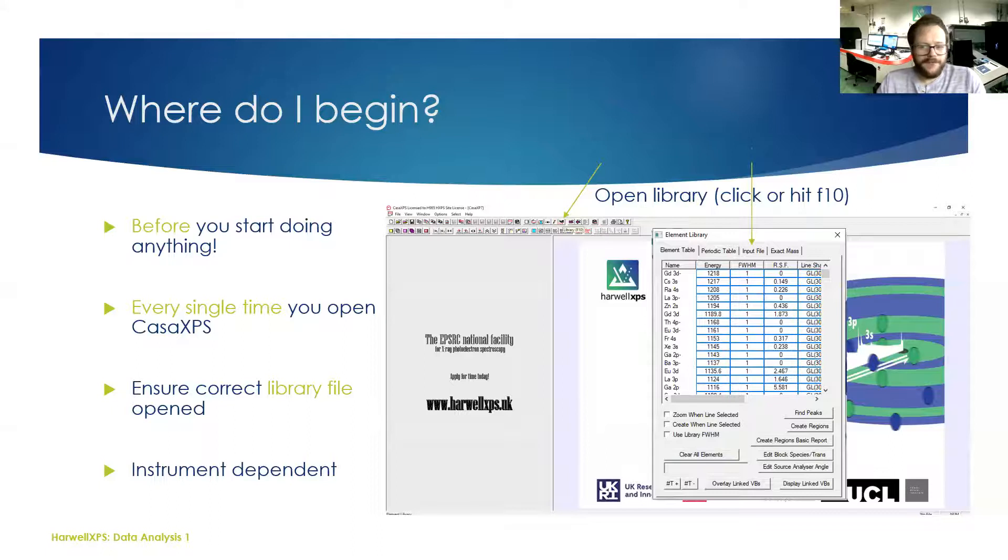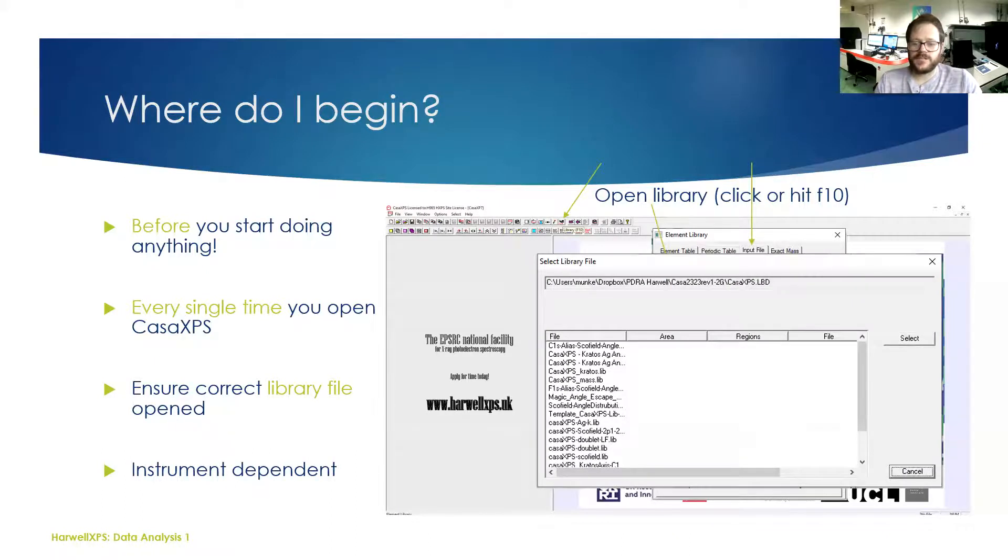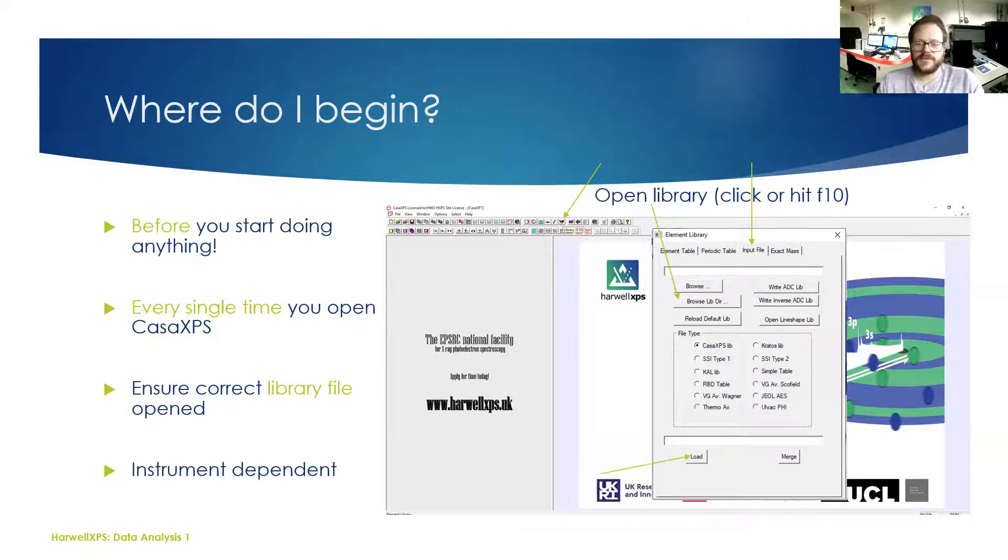Go to the library, where we've got the arrow there, or hit F10, and you're going to want to go to Input File. In that tab there's an option called Browse Library Directory, and then you just need to select which library you want. For example, if we were using a Kratos instrument, we would open up CasaXPS_Kratos.lib. Then you can just click select and hit load. You do need to do this every single time you open up the software.